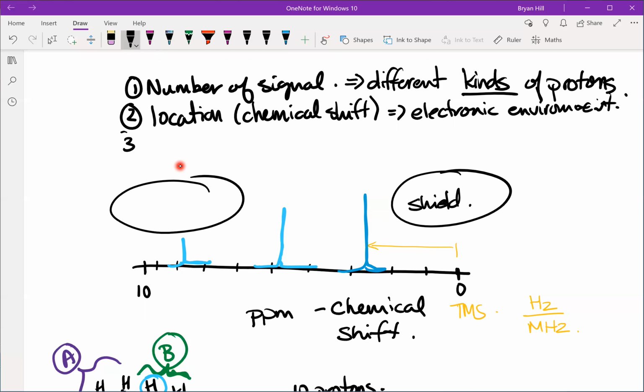The third thing was the intensity of the signal.